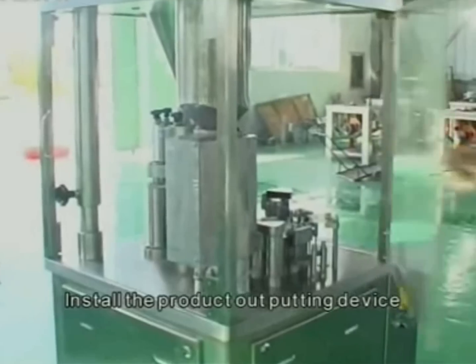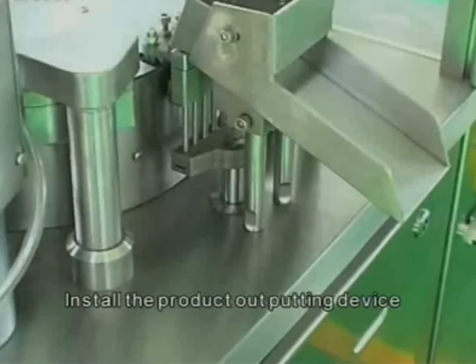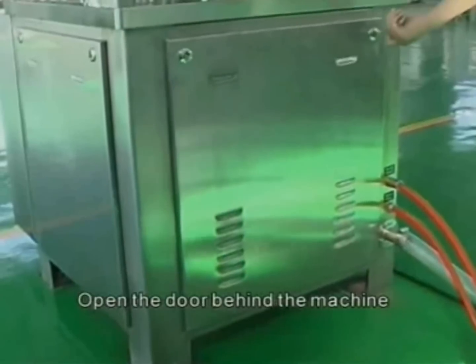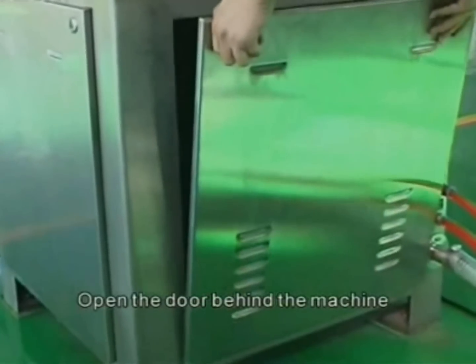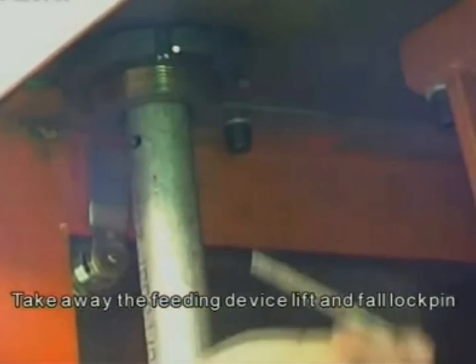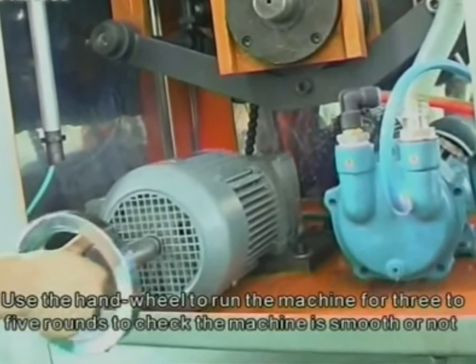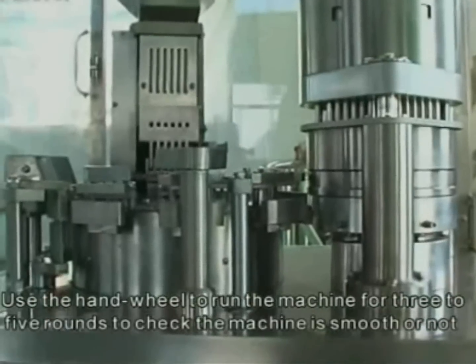Install the product outputting device. Open the door behind the machine. Take away the feeding device lift and fold lock pin. Use the hand wheel to run the machine for three to five rounds to check whether the machine runs smoothly.